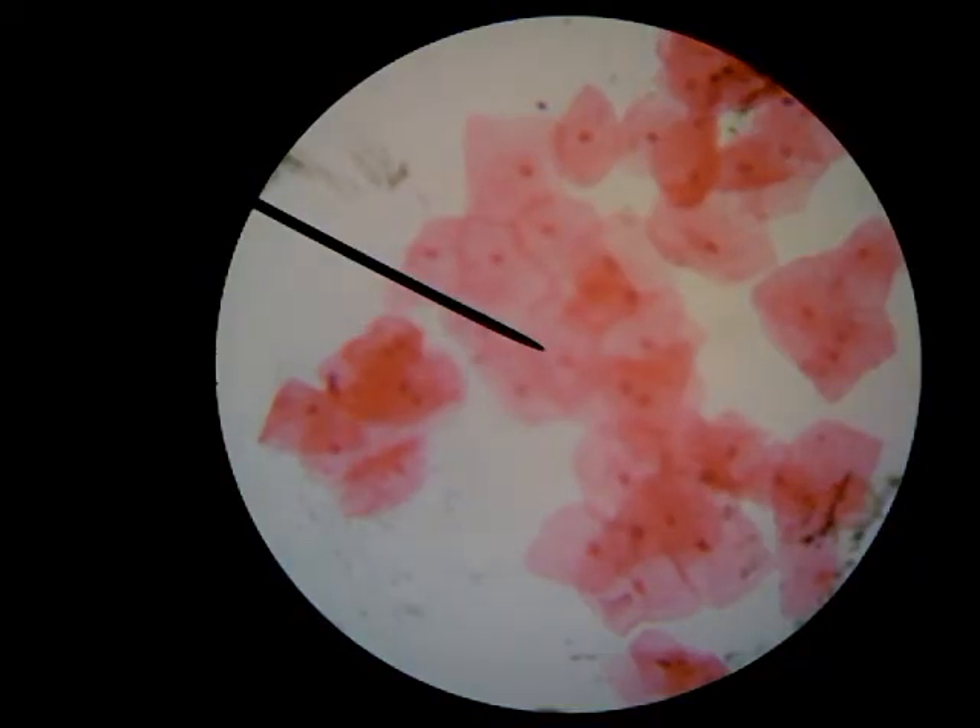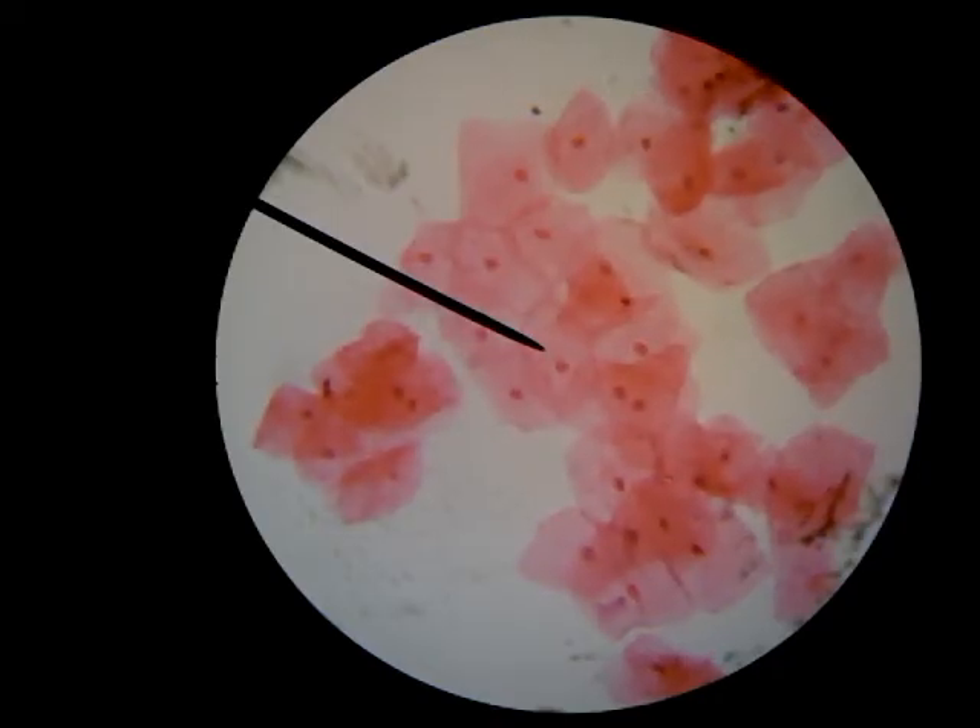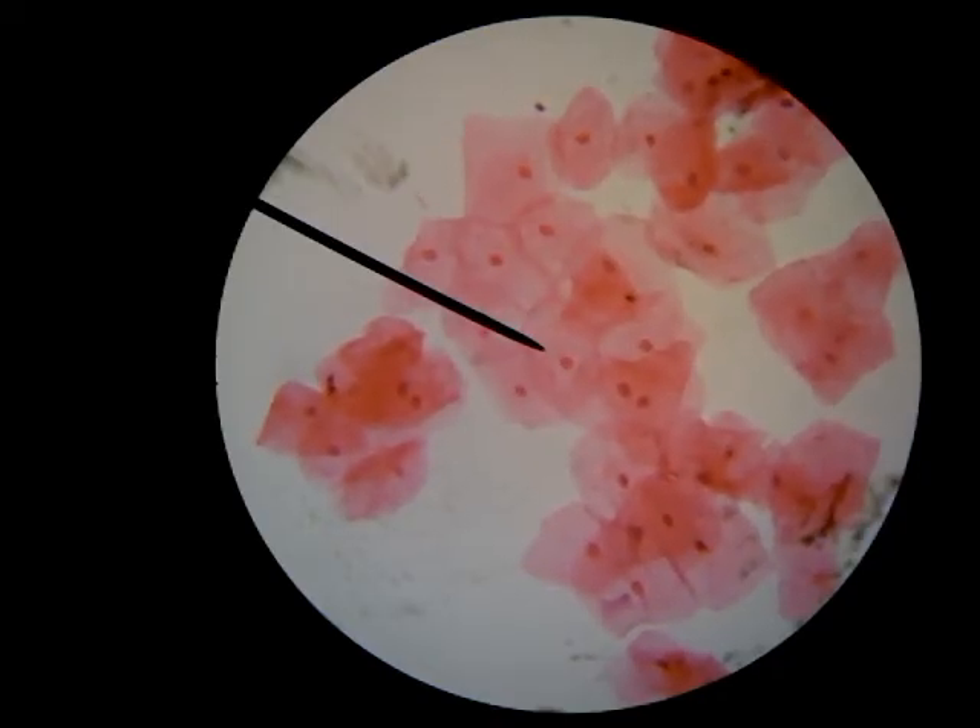Here we can see our human cells. I'm just going to do some fine adjustments — and there they are. We have cells here; they're kind of stacked on top of each other. If you can see my pointer, this one is kind of on top of these others, but the little dark spots inside them — the small round dark spots — that's the nucleus of those cells. That's where your DNA is stored, the brain of the cell. There's no cell wall here, that's why they're all kind of different shapes and just kind of blobby. We have cell membranes on animal cells, but we don't have cell walls, so the shapes are a little looser and less well-formed.